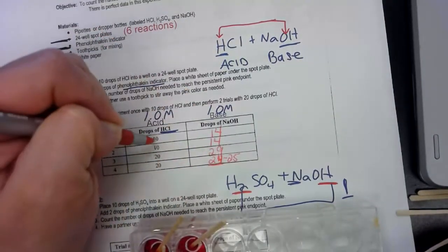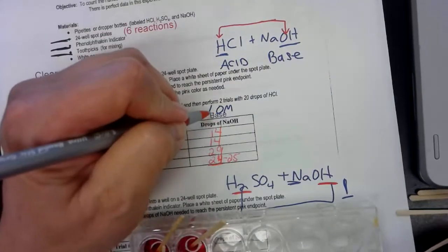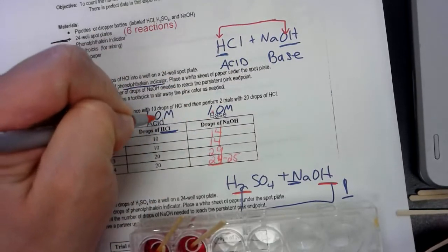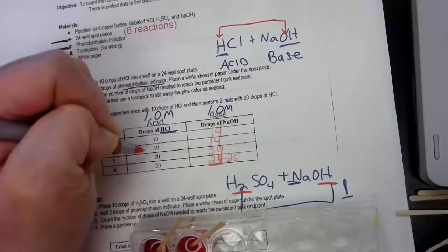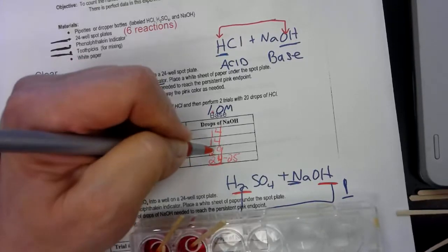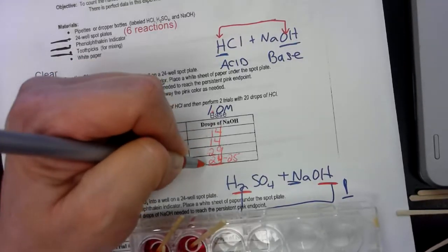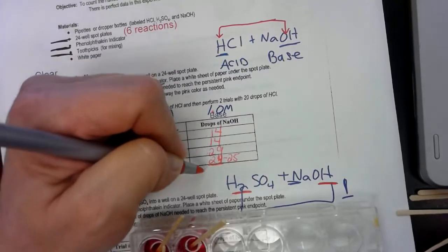Okay. So this is telling you it should be close to 1-to-1, but it could be that my solutions were off, that these weren't exactly the right concentrations of moles per liter. So, but hoping that they were the same. It definitely got higher, almost doubled, which is a good thing, because having twice as much acid, you should have twice as much base.